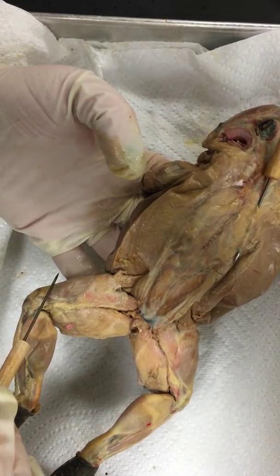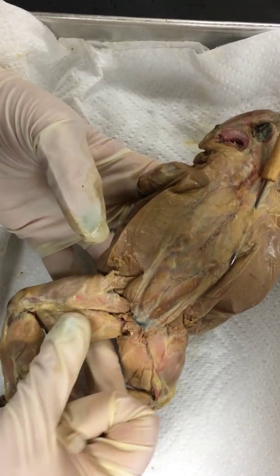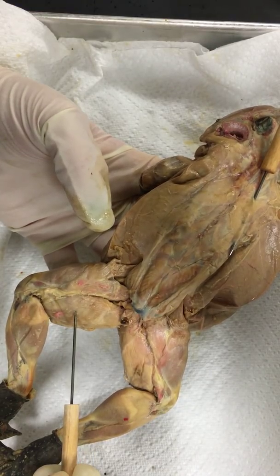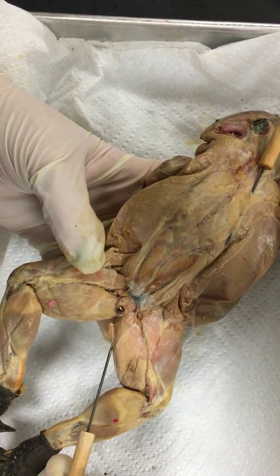Now where's his femur? The bone goes right in here, so the triceps femoris sits right on top of the femur. This big thick muscle right here is his semimembranosus. Then there's the gracilis minor — it's going to be this little tiny flappy one up underneath here.